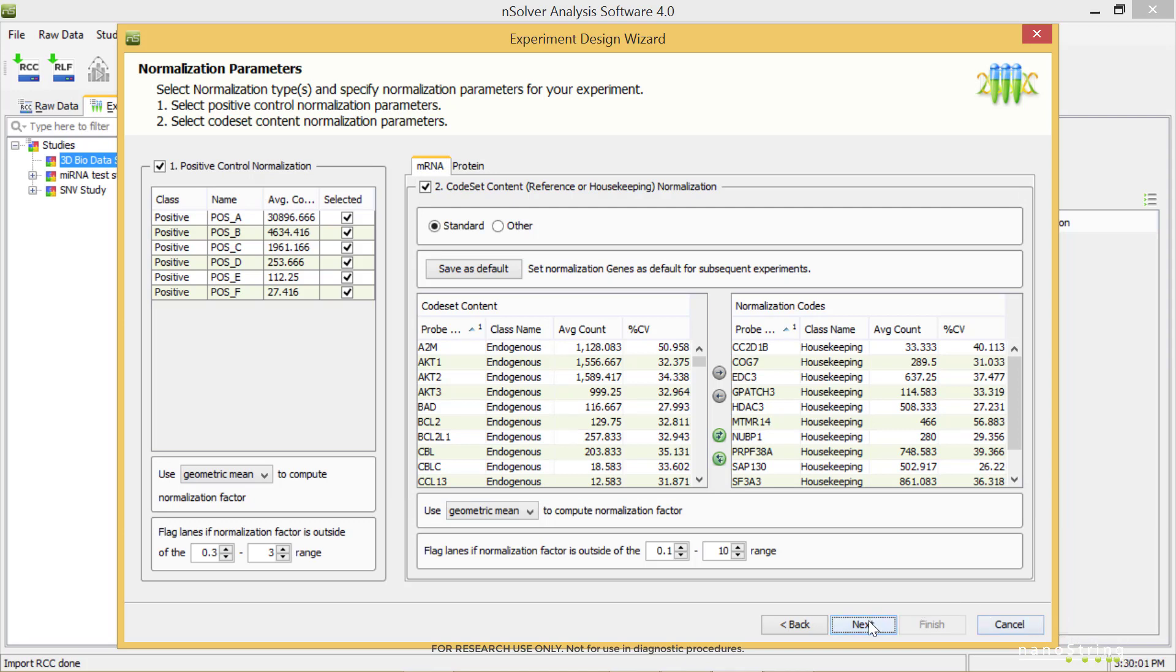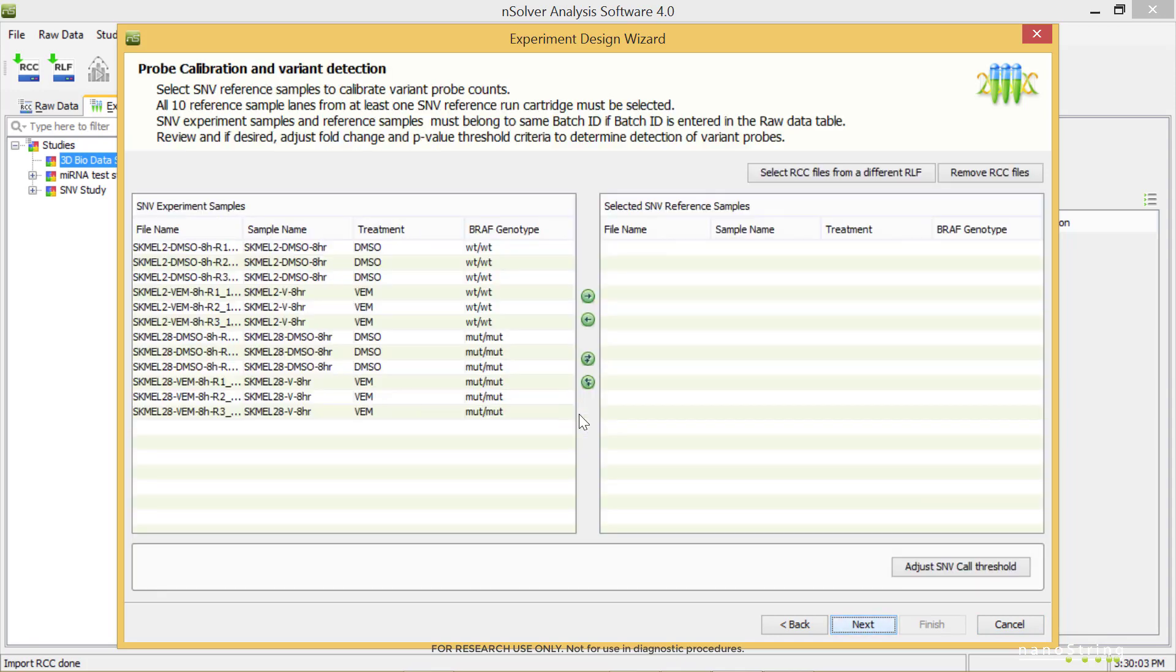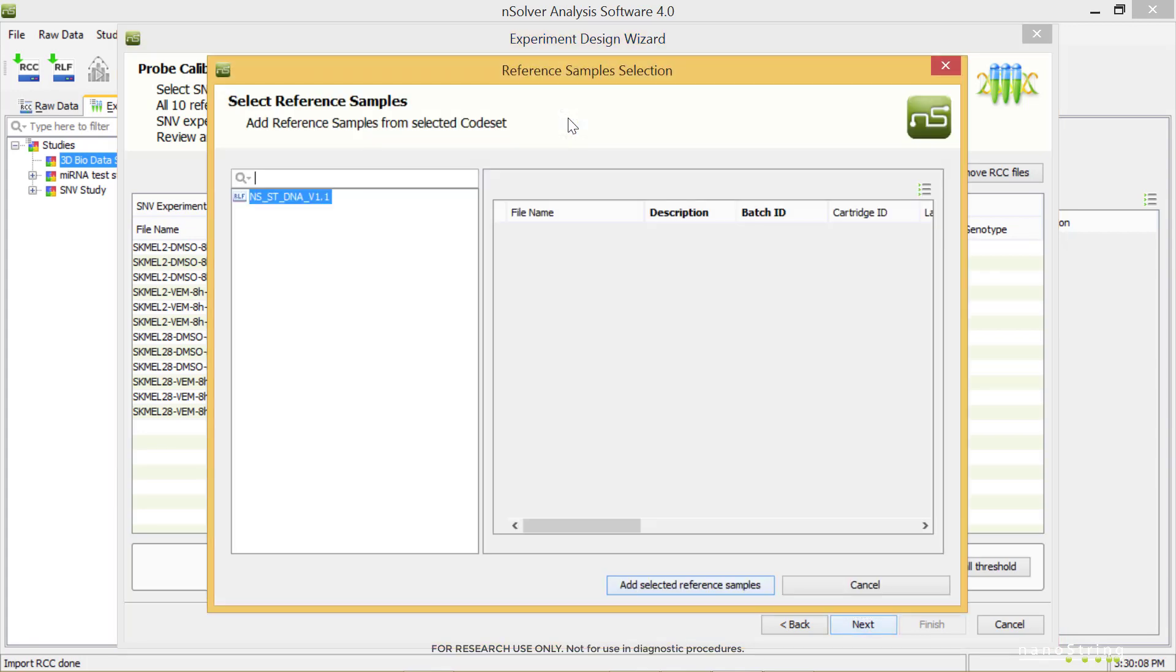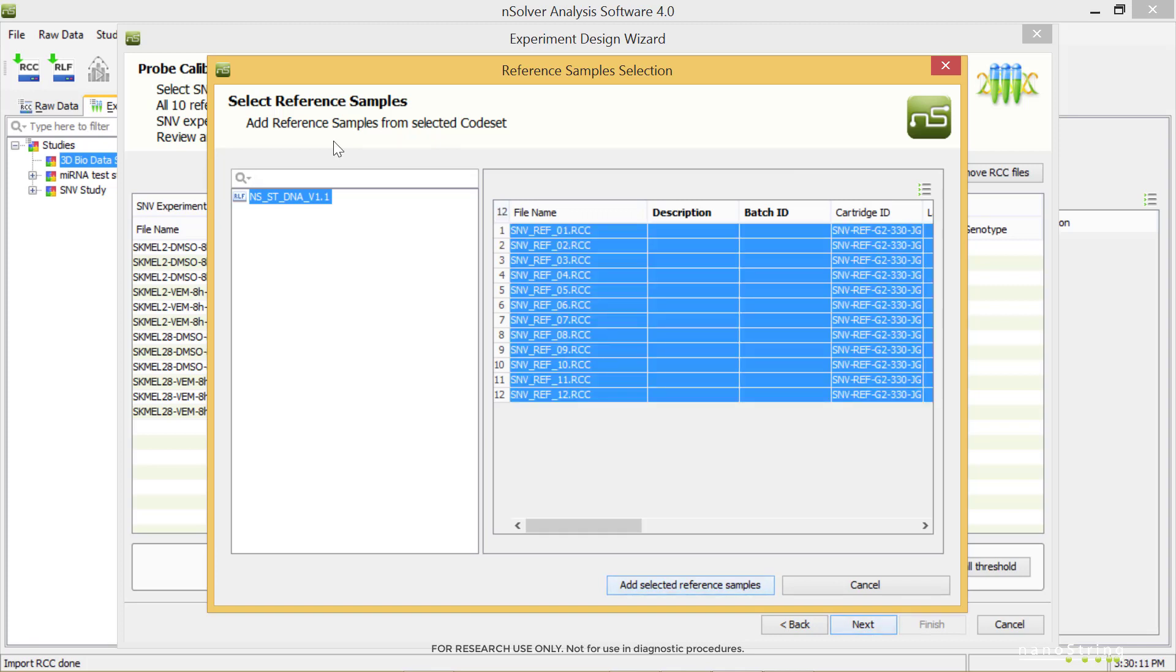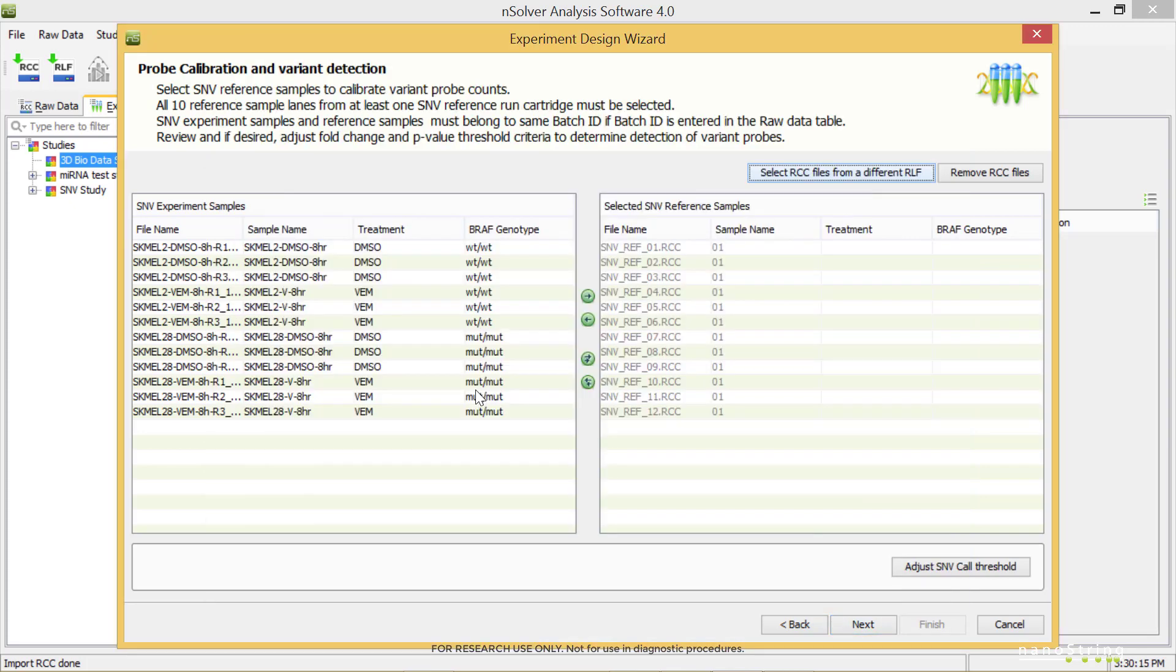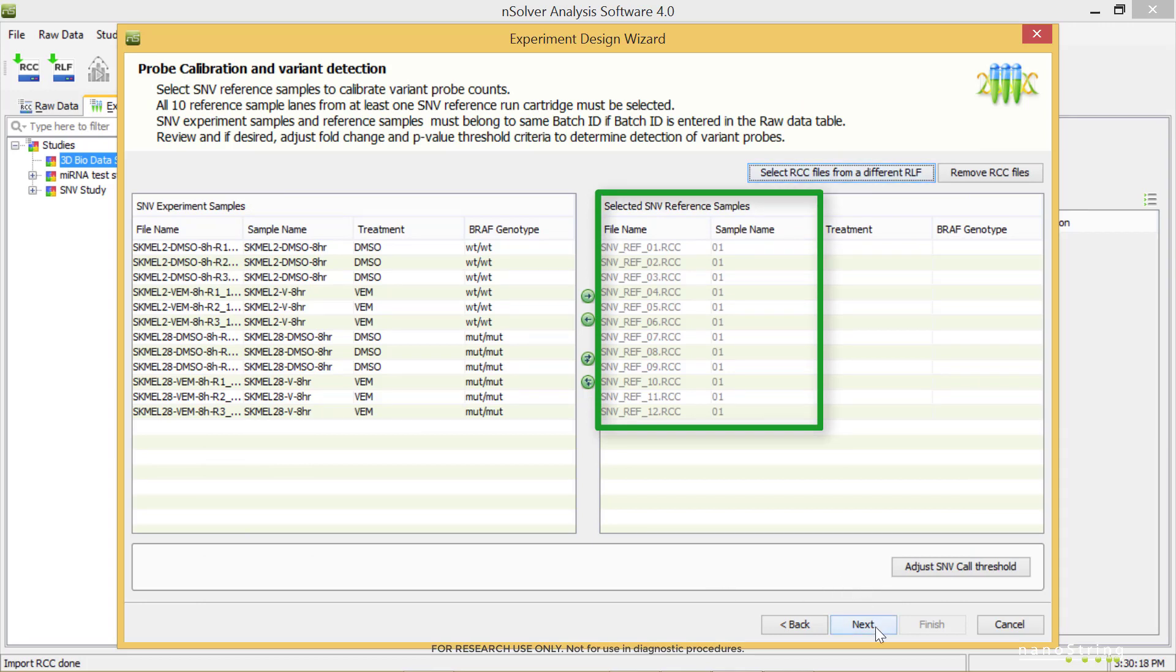The next step in the analysis of this example dataset is SNV probe calibration. Use the Select RCC files from a different RLF button since there are no SNV reference samples under the present RLF. Highlight the NSST DNA code set and highlight all SNV reference samples, and select Add Selected Reference Samples. You should see the SNV reference samples in the Selected SNV Reference Samples window. Select Next.